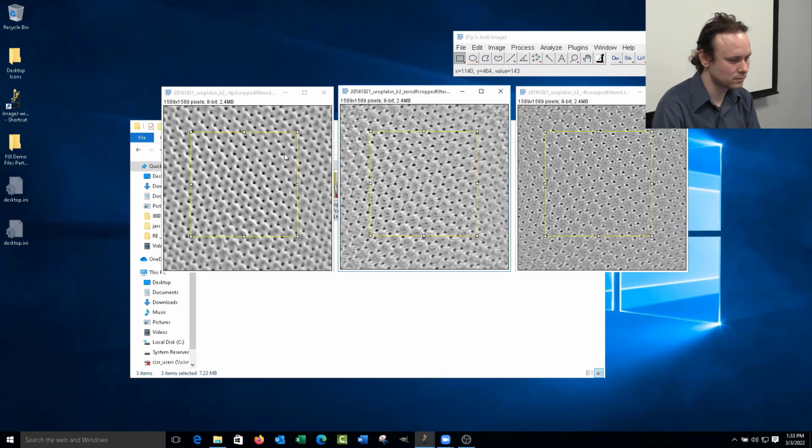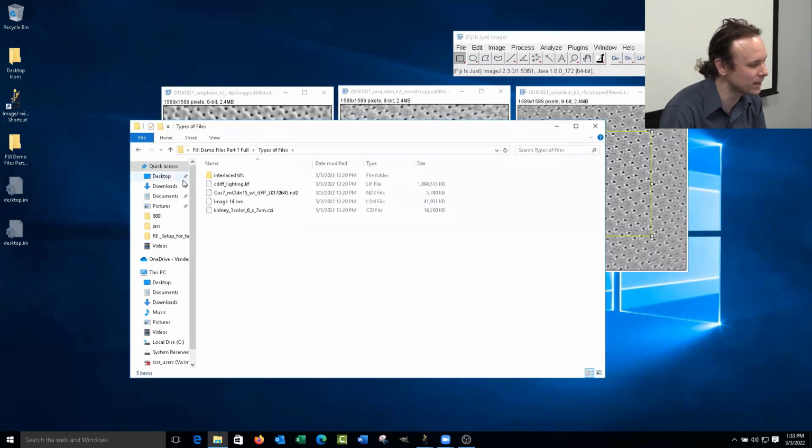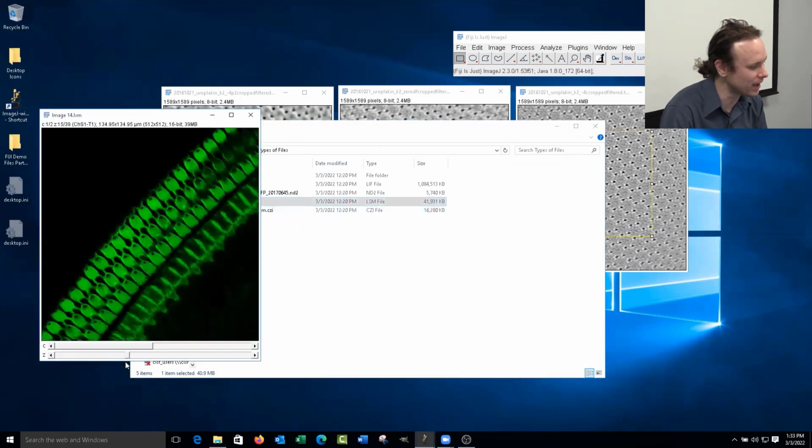I think you already moved on, but I noticed that whenever you exported it as an RGB color, you could only find the exact same slice that you were on. Yeah, that was a bit of a mistake I made. It will do the whole thing. Okay. I was wondering how did that happen? I think it's because I applied something to a single slide, likely because I had a square in it.